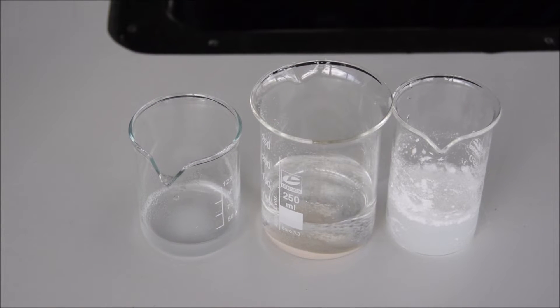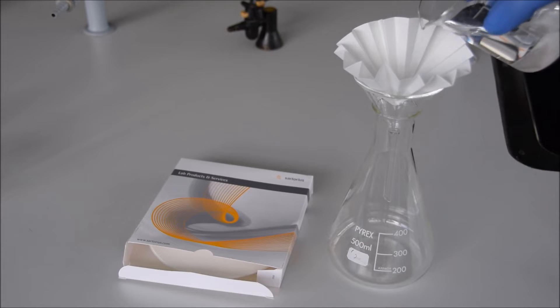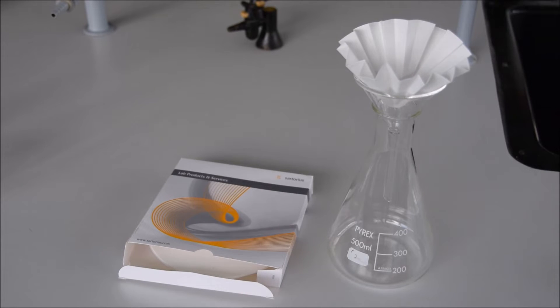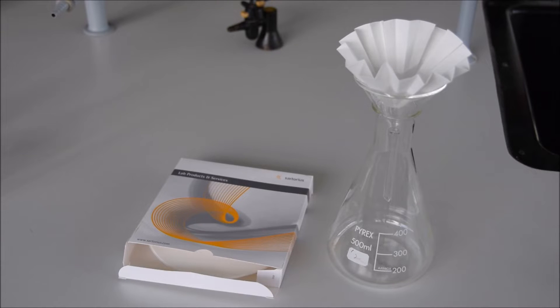The easiest one to separate with a plain funnel and a fluted filter paper is the sand and water, or the heavy material we want to leave behind and the liquid we want to separate out. A fluted filter paper works really well here because the liquid can travel very quickly through it because it has such a large surface area.